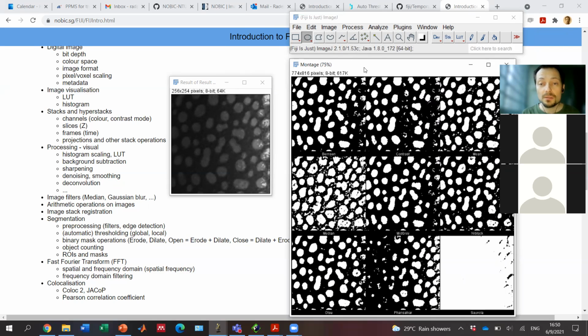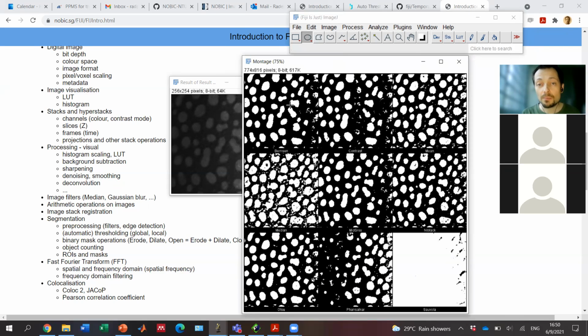You see that some of them work quite nicely, some not so nicely, but obviously it's much better than when we did the global threshold. For example, this one here failed miserably, but this Bernsen algorithm seemed to do quite well. Or this Mid-Grey is also not that bad, or the local Otsu algorithm also did quite well.